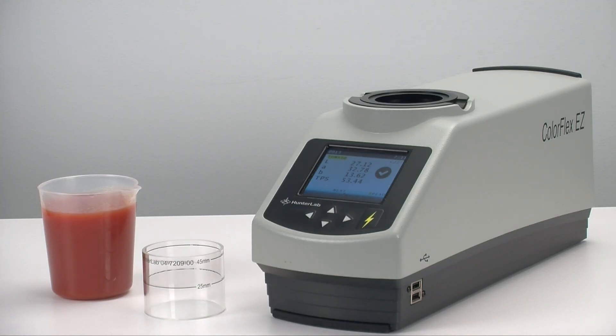Let's see just how easy it is to measure the color of a tomato juice sample. This is generally a three-step process using the Hunter Lab tomato product setup.